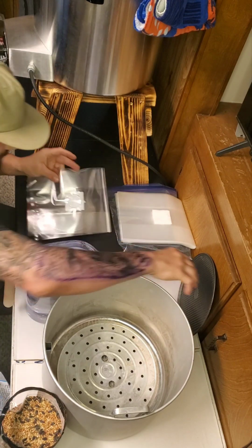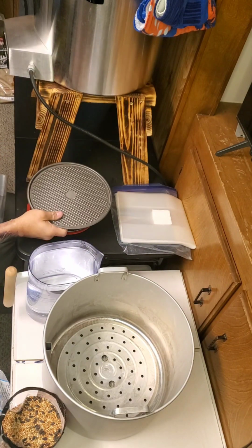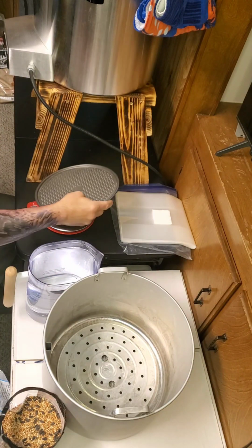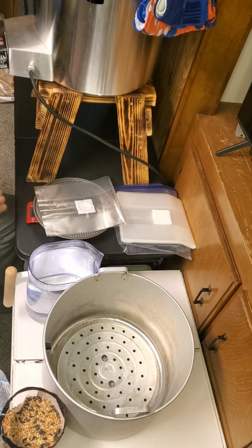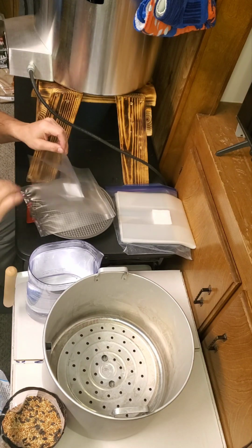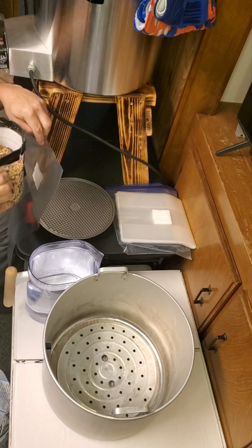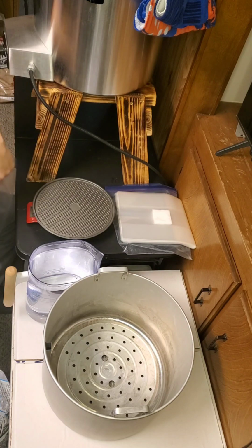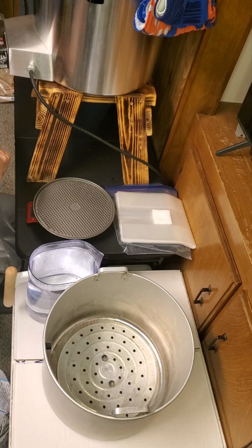Big old scoop. So the first thing we're going to want to do is get our, I'm using the cake pan, which I use to weigh and put on top of the bags. Turn it on, make sure it's all tared out, 0 grams. And then we're going to have 1,000 grams of bird seed. I put tape on here because I've been poking holes in my bag with it. So gotta watch out for that if you're cutting anything yourself. I cut it down and then put the duct tape on there.